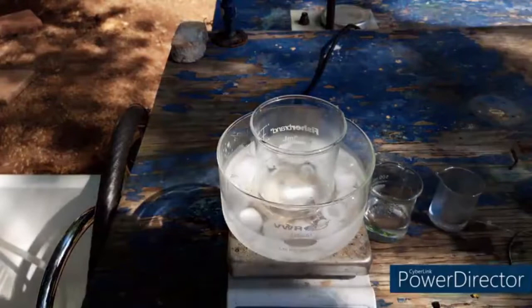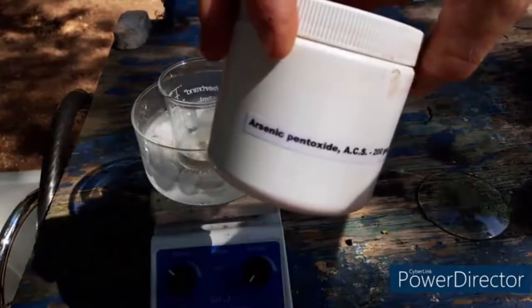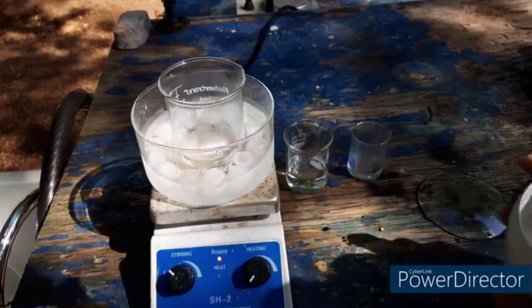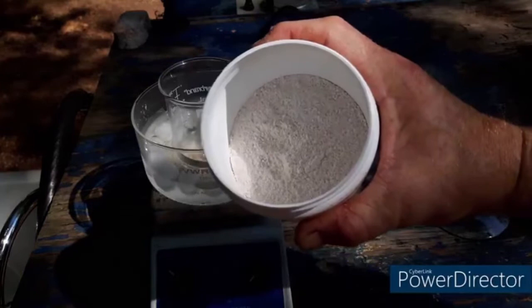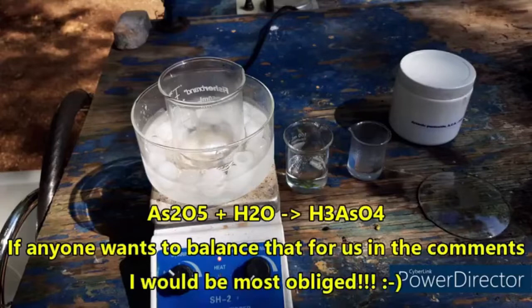This is our arsenic acid that I made from dissolving arsenic pentoxide into water. For our arsenic pentoxide I have this. This was sent to me by the gayest person on YouTube. We have a fifth of a kilo of arsenic pentoxide. Look at it, it's beautiful, fucking beautiful. I got some arsenic trioxide too. So you dissolve arsenic pentoxide in water, you get arsenic acid.